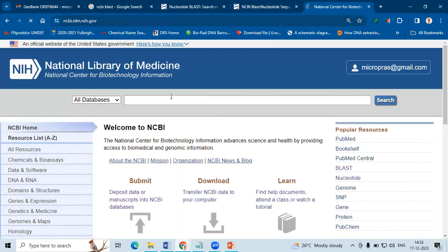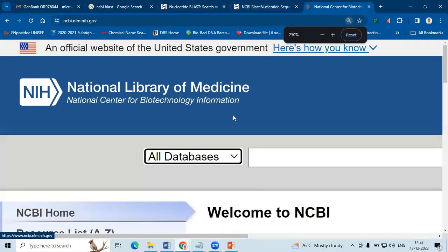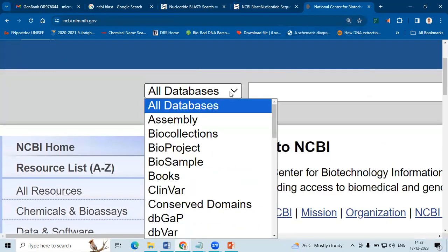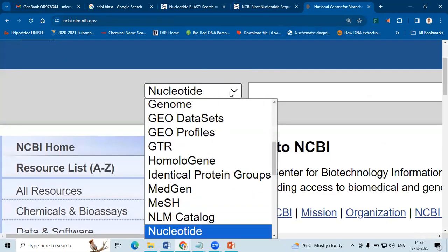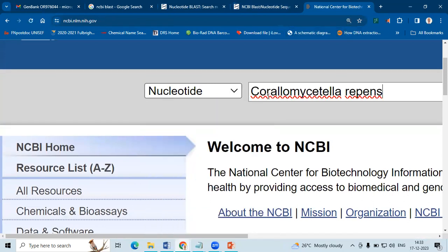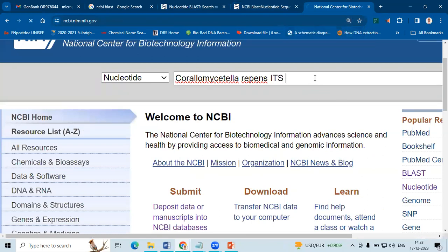So go to NCBI. Here select data nucleotide. So here paste the sequence to see how many sequences are available. So this is ITS already available in GenBank.